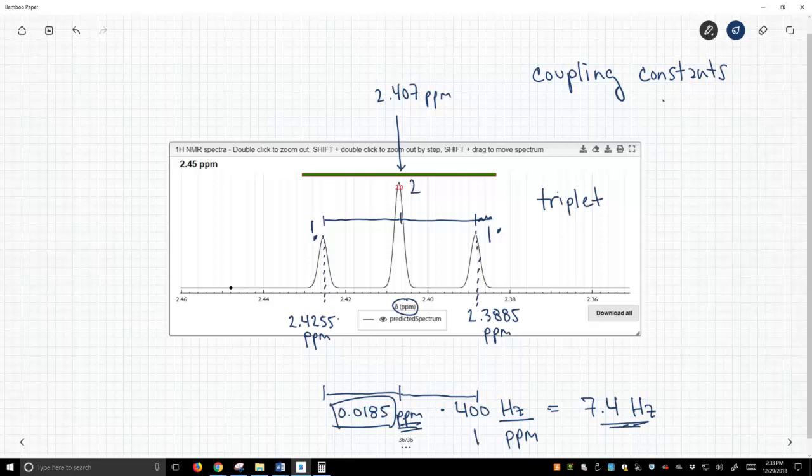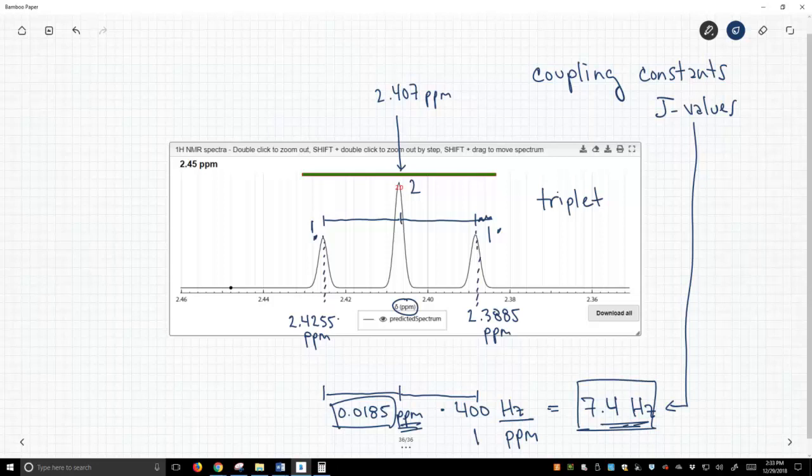Coupling constants are sometimes referred to as J-values, and the J-value for this particular triplet is 7.4 hertz. So, we'd say the J for this peak, this triplet, is 7.4 hertz.